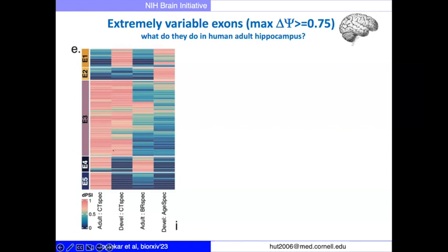And so what you see here is that you have a bunch of exons which actually have very high variability early on in development and in adulthood. Then you have quite a few that have it in adulthood, but did not have it in early development. So they're the ones that gained it, and of course we observe the opposite as well, where some lose it. Now, for the ones that gained it, so that come without cell type specificity, but then gain it in adulthood, interestingly, there's some that only get it in one brain region or a reduced set of brain regions, whereas others get it in all of them, so that there's no brain region specificity.